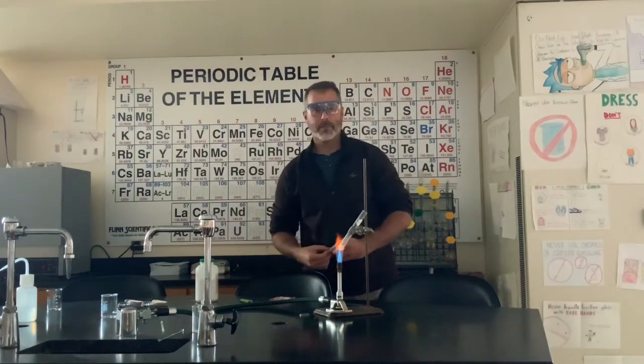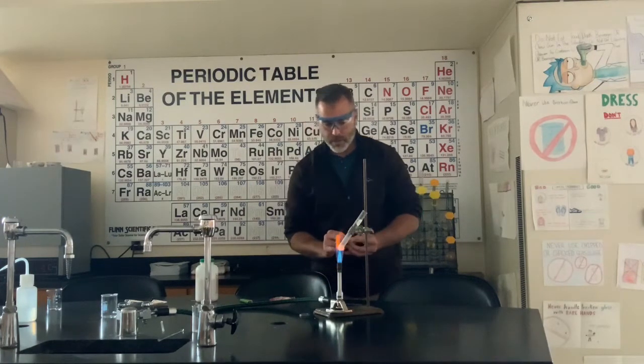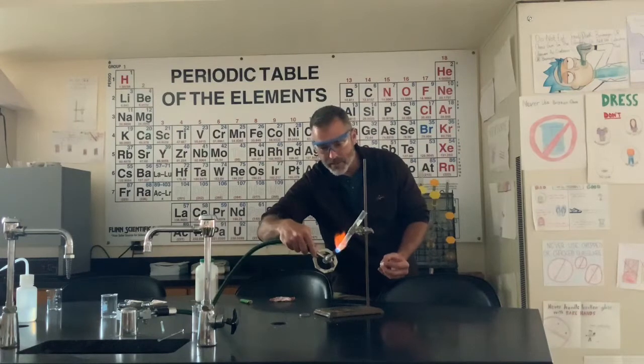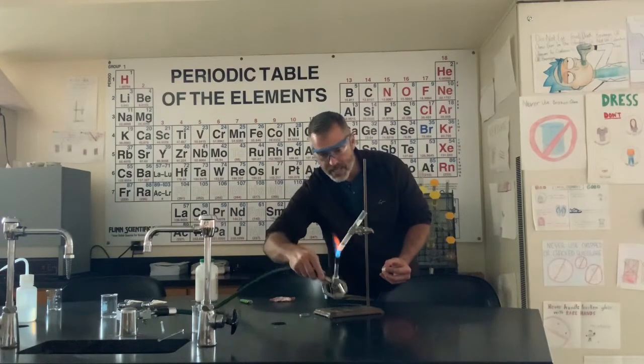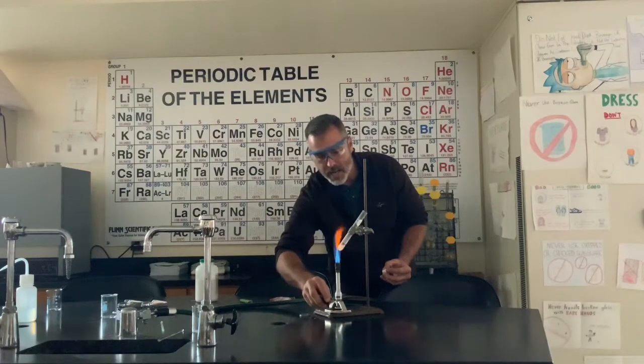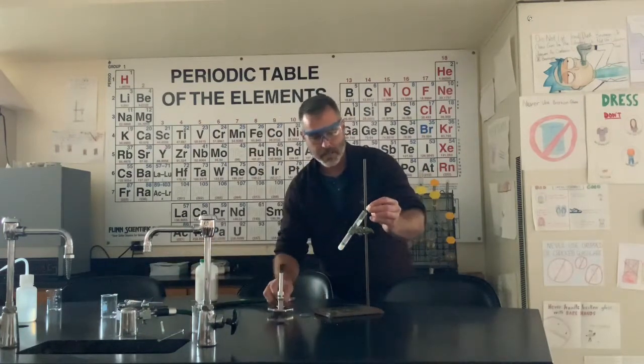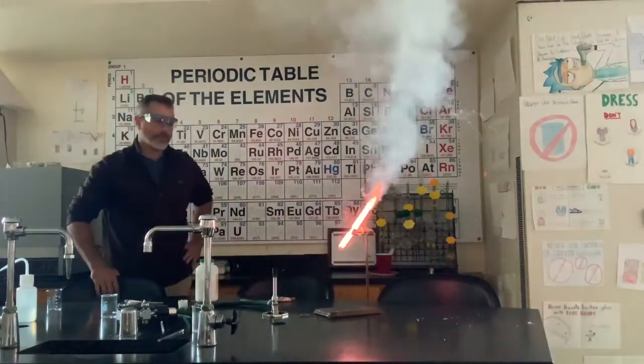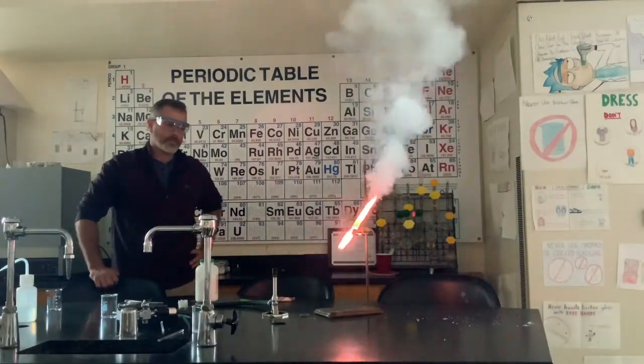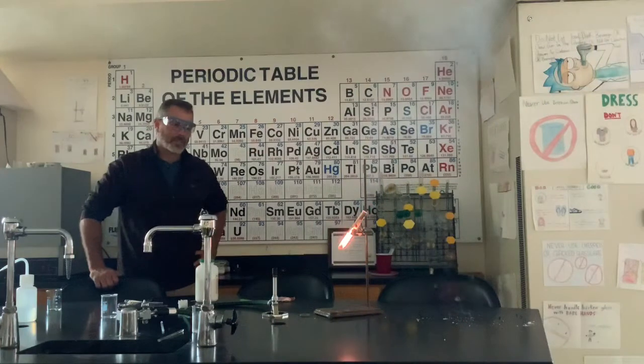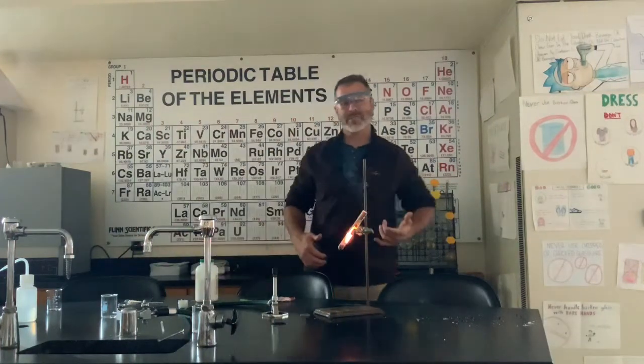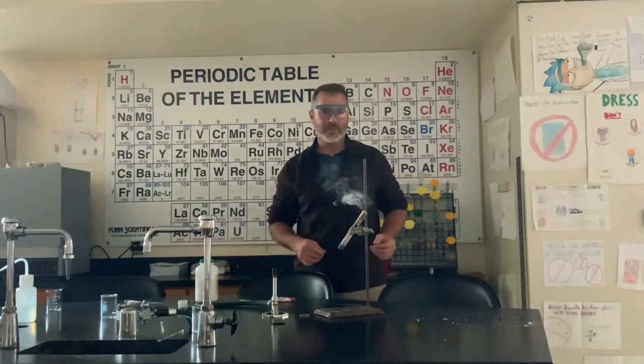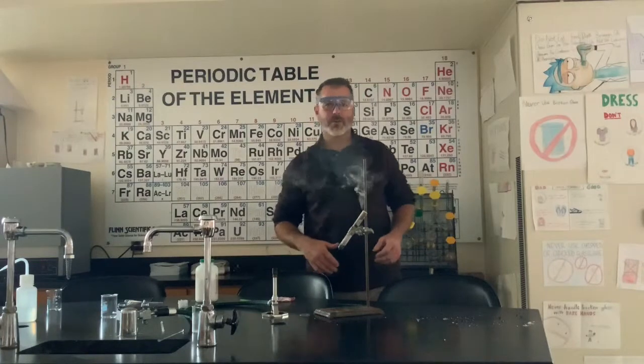One of my favorites. Combustion. So we are completely liquefied in there. We should have a gas coming off, which I can see, but it's probably hard to see on the video. There's a nice gas coming out. It's bubbling down here. Nice and hot. We're going to turn this guy off and... We have our combustion, which we're going to call C6H12O6, sugar of sorts, plus oxygen gas. It's going to have a combustion reaction. We form two specific products in the combustion reaction. We're going to call this complete combustion. So those are all five reaction types for all the demonstrations you've seen.